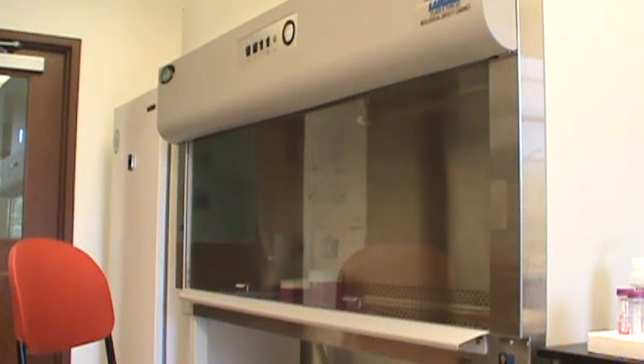This is a laminar flow hood. It is used in tissue culture work to keep samples of cells sterile, so the cells can grow in sterile liquid culture medium but will not be contaminated with bacteria or fungi.